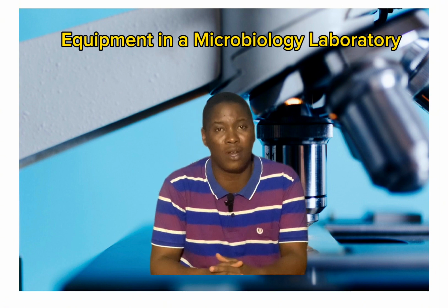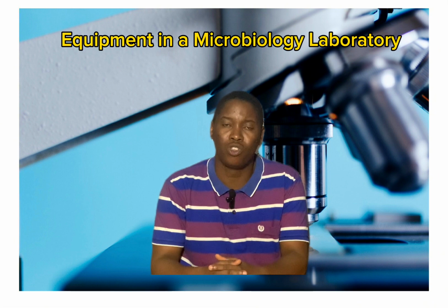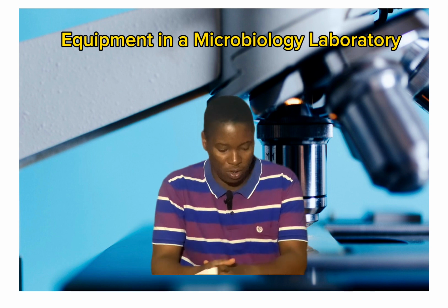Also, you have Bunsen burners. These are metal structures to which flames can be put in, and they provide flames that are used in the microbiology laboratory. These flames are usually used to sterilize equipment. They are used to sterilize the mouths of test tubes, they are used to sterilize inoculating loops, and they are used to sterilize different equipment that are used in experimental procedures in the microbiology lab.